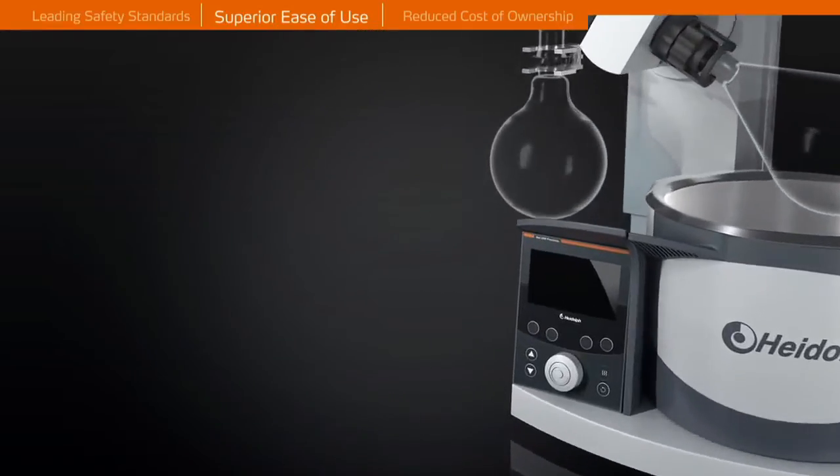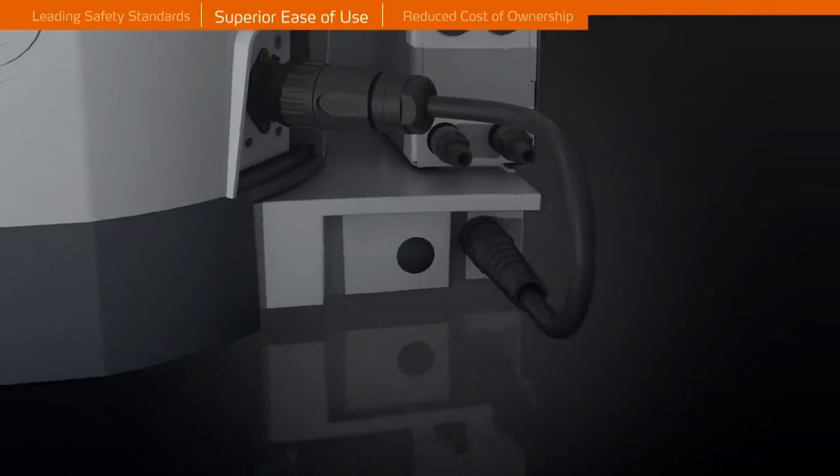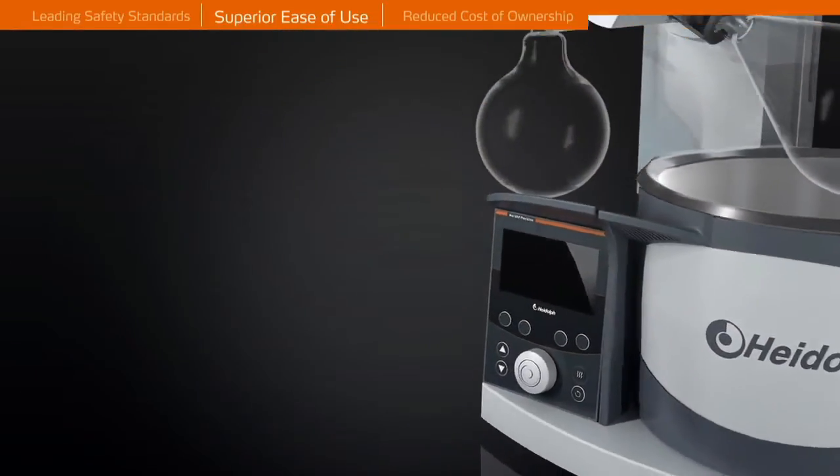The bath cable coupling complies with high protection class IP67 to prevent corrosion, dangerous short circuits, and interruptions to your workflow.